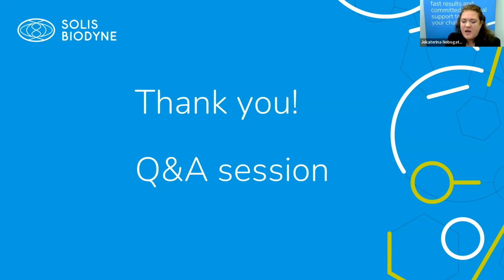Thank you, Mikko, for the question. Lately, due to the COVID time, we had to move fast, learn fast, and find more employees who were not so much trained, doing a lot of assays. That means a lot of amplification of the same target in the same lab, and maybe not so much cleaning every time, and maybe not following the rules because you want a result really fast. So carryover contamination has become a real struggle for a lot of labs.